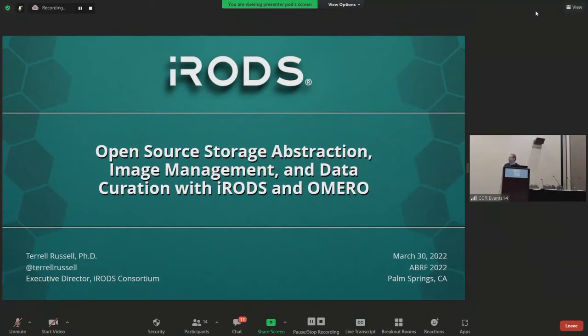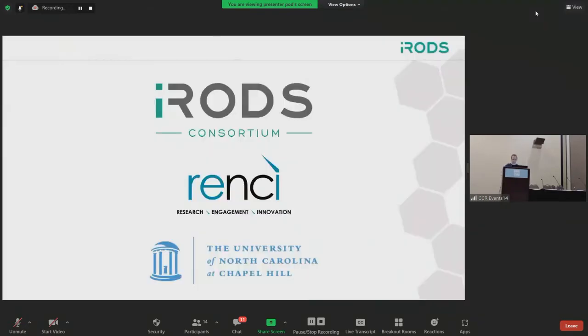I had learned about OMERO about 2 years ago as we worked on a project at UNC through Michelle's core. And I think it's amazing, and I don't want to reproduce it, but I think we have a lot to add from where I sit to make them talk to each other. So I'm going to talk a little bit about that process and how we got there, and a little bit about the future.